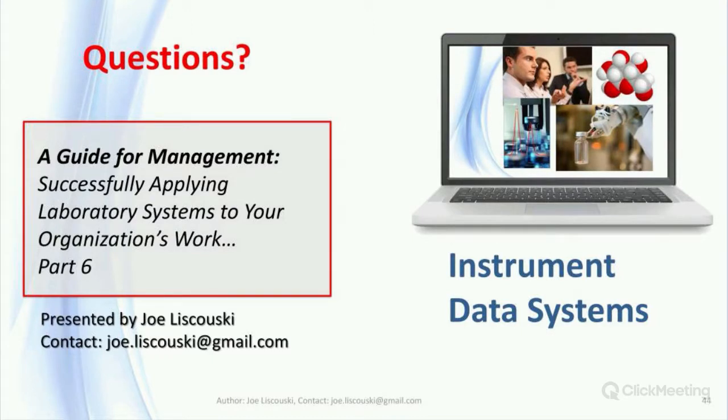The question that came up is how to handle complex data and instrument interface in a LIMS. Don't is a simple answer. If you look at what we talked about in the first few webinars, there are different implementations of LIMS systems. Some of them are on-premise.